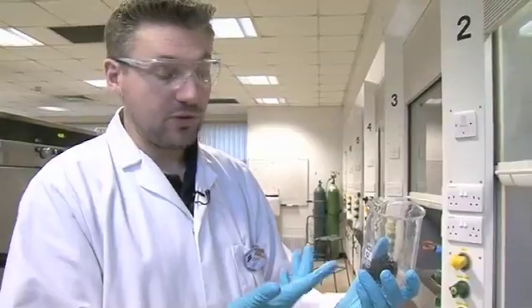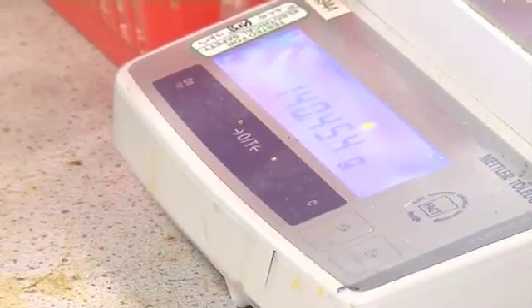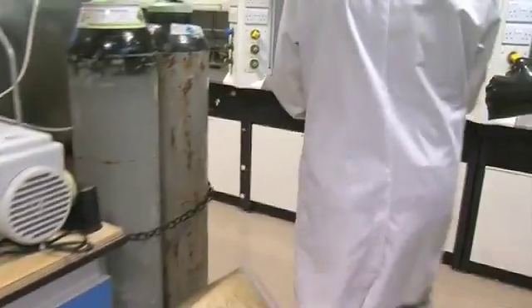Like all our uranium in the lab, this is depleted, which means that essentially all of the radioactive component has been removed, so this is essentially non-radioactive. It's toxic as a heavy metal would be, like lead, but it's no worse than lead really. I'm just weighing it now because part of the rules governing our use of this material is that we have to keep an accurate measure of how much we've used every time.